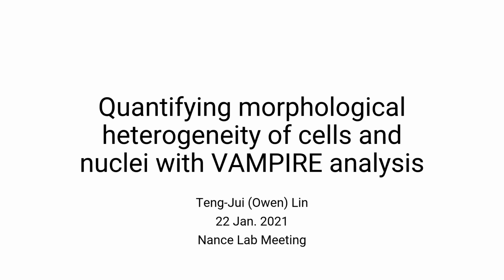I joined the lab last November and today I am presenting on quantifying morphological heterogeneity of cells and nuclei with VAMPIRE analysis. This study was published in Nature Protocols this year by Wu and Wirtz.